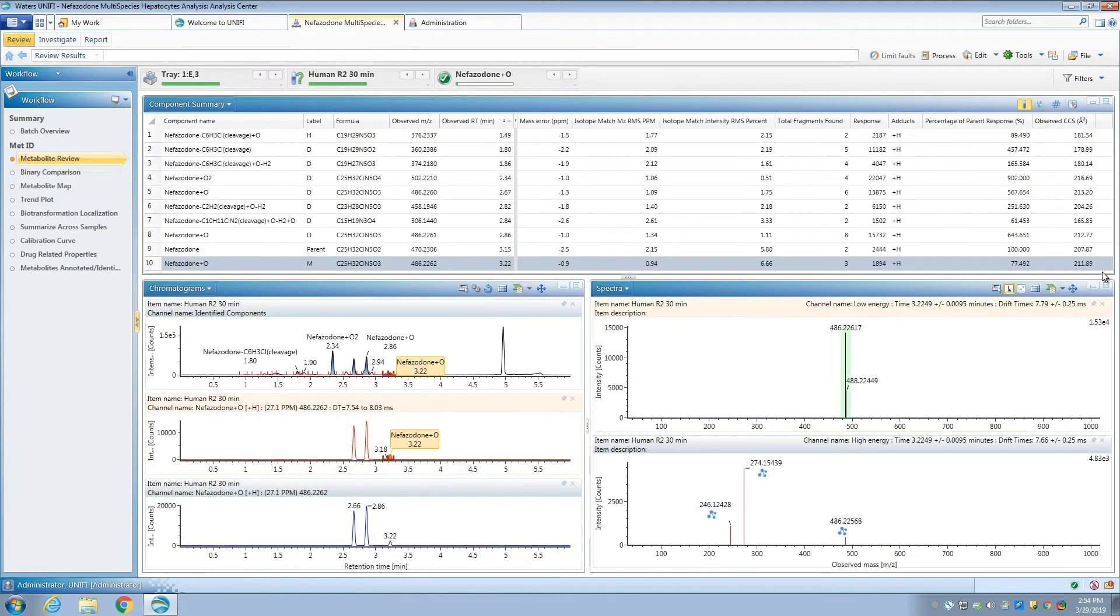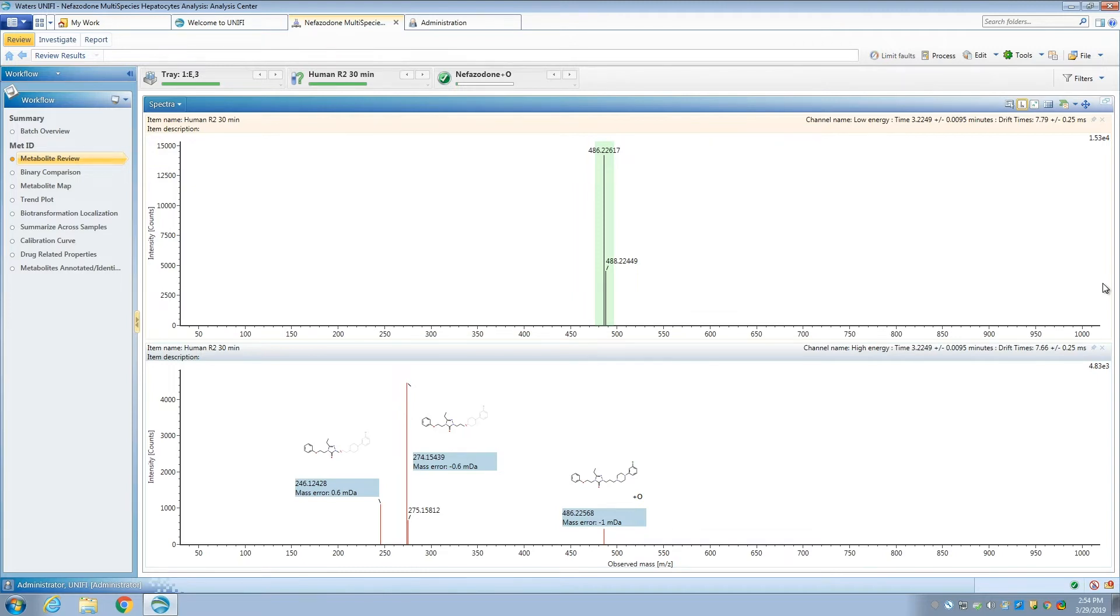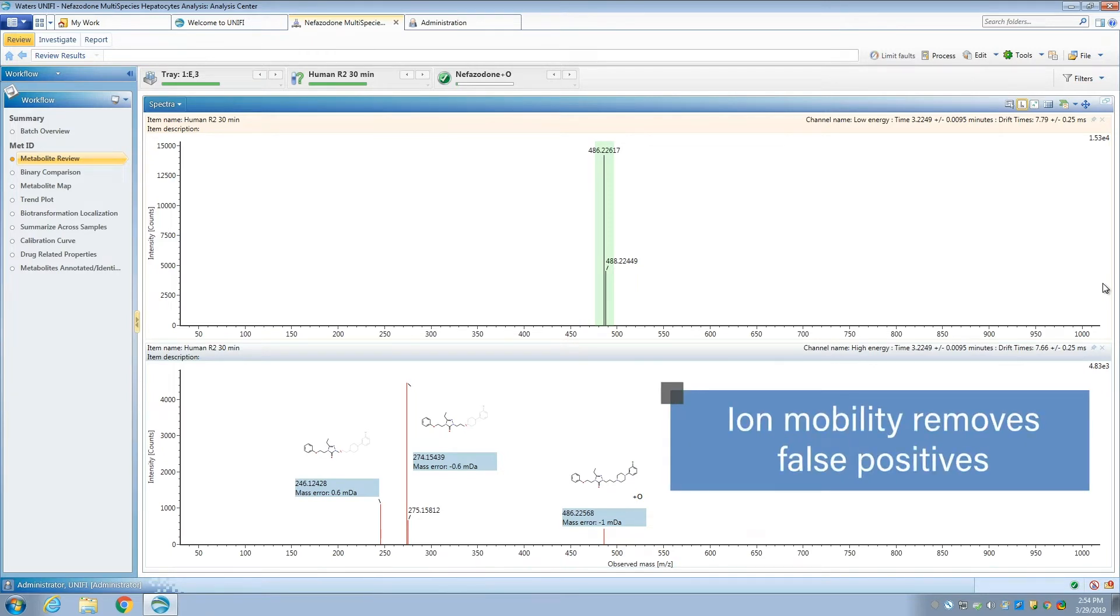The process is similar for spectral review. You can quickly review data in both the default ion mobility mode and see what the data looks like in regular full scan mode. The advantage is clear. Ion mobility sweeps away all the ions that are not related to the peak of interest, removing many false positives.